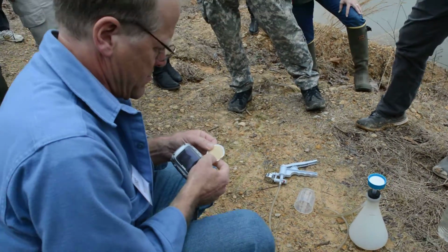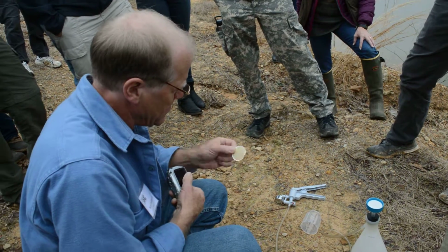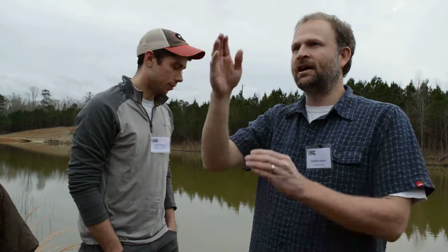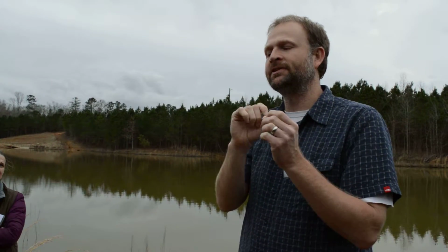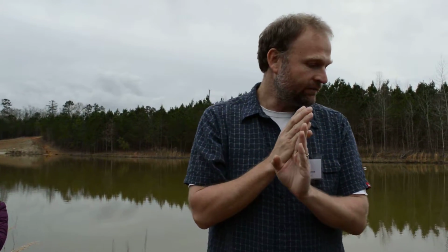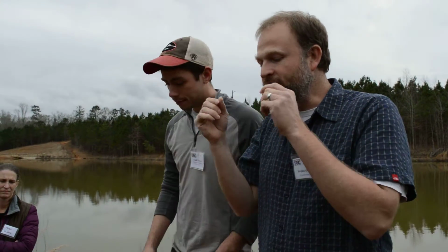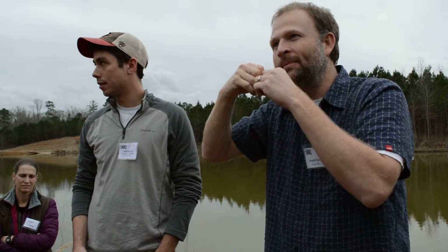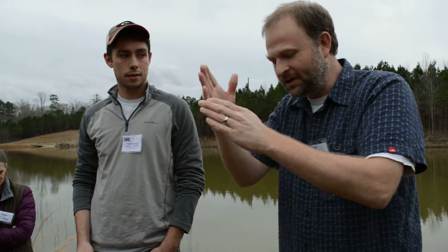Okay. But one thing, particularly if you're filtering for someone that's then going to have to do this in the lab, to be nice to that person, the way at least our extraction protocol is, we don't actually extract off the entire filter. We cut it in half and then do half a filter. That's partly just so you have a backup in case something goes wrong, and usually the filter is enough. But if you just jam the whole thing into a tube with ethanol, so it gets all crumpled up, when you're trying to cut it evenly in half, it makes it pretty much impossible and it'll rip it up.